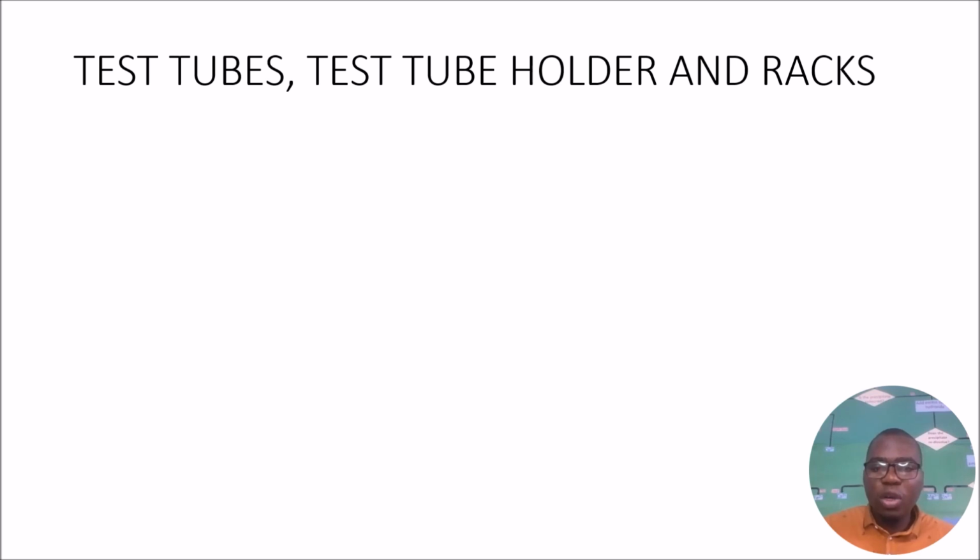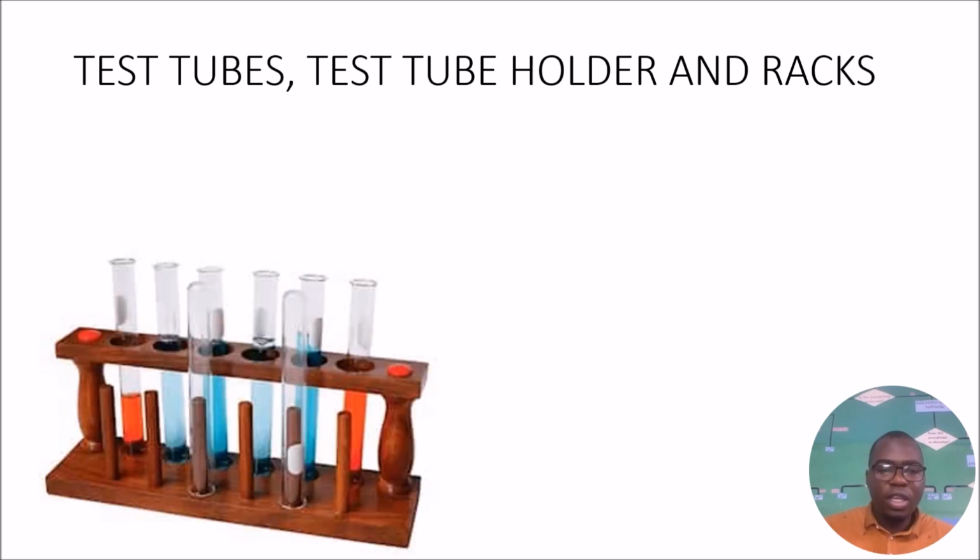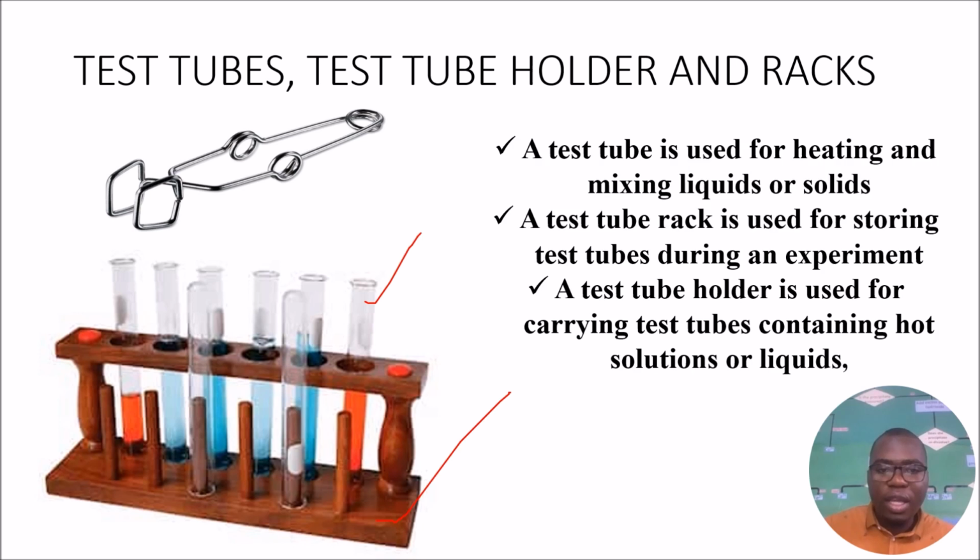Test tube holders and test tube racks. So here we have test tubes, okay, and then the wooden part here is a test tube rack, and then this one here is a test tube holder. So a test tube is used for heating and mixing liquids or solids.